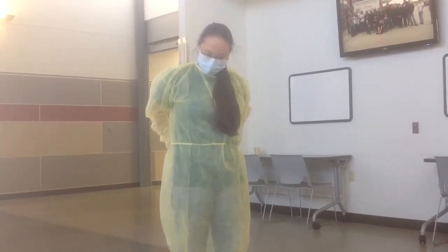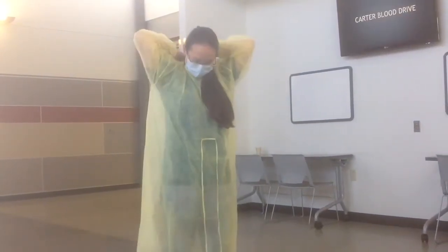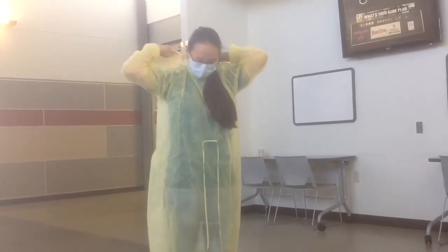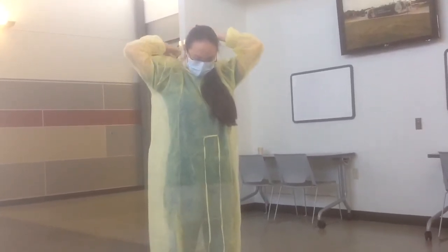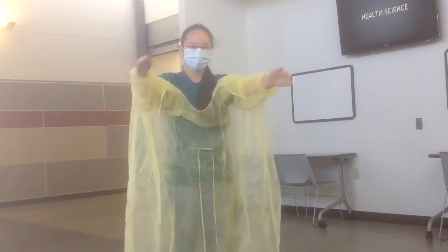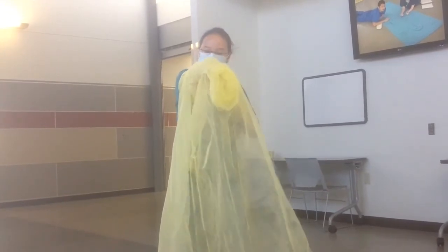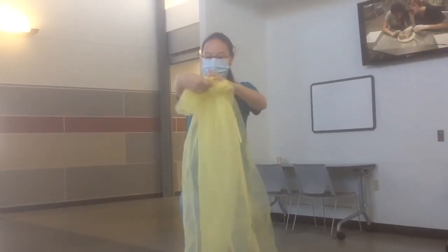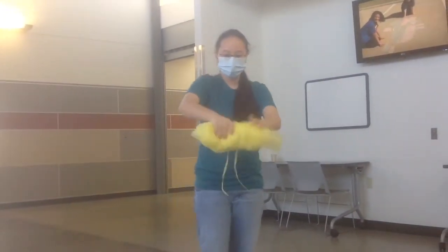Then take your gown off and untie the bottom first and bring it out. Then take the top and untie it. Once untied, take the top of your gown and fold it below your shoulders. Stretch your hands out. Put one hand under the sleeve and pull it over. Do the same thing for the other sleeve. Roll away from you, making sure that you only touch the inside. And dispose of it.